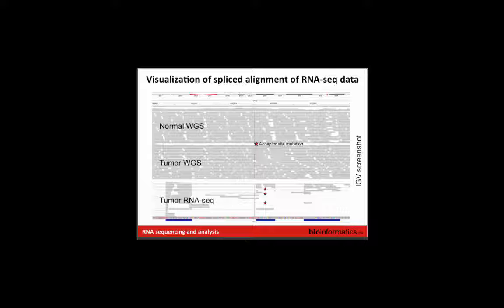So the stuff that's in between, is that an alignment error? Because the stuff in between, how do you get that? These guys? Pre-mRNA? Yeah, so this is a really interesting question. To think about what these things are and what they could be. Does anyone want to guess?